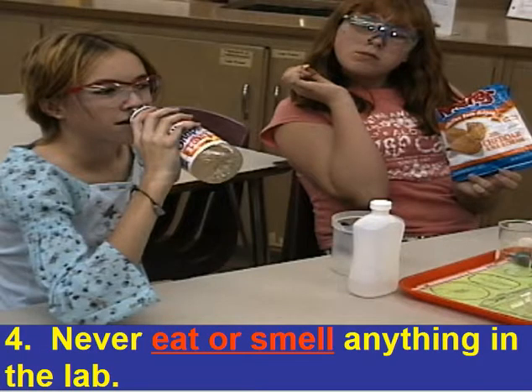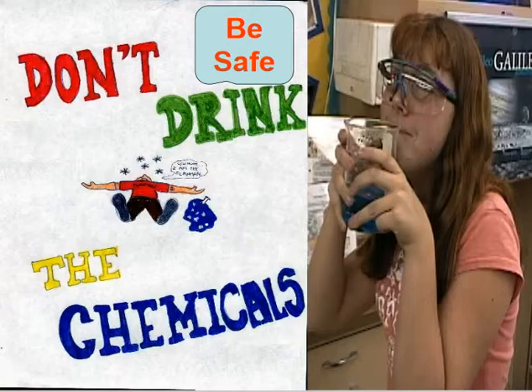Never eat or smell anything in the lab. And a good reason for that is because a lot of the chemical substances we're going to be using, they're clear liquids. They look a lot like water. So if you just came in here and drank it, you could potentially die. Or don't use the glassware, because a lot of the glassware we have has been used for acids. So if you come in here and say, well, I'm going to get a drink, I'm going to use this beaker to fill it up out of the sink, and then I'm going to drink from it, you may be drinking acid with it. So don't drink the chemicals. Be safe.